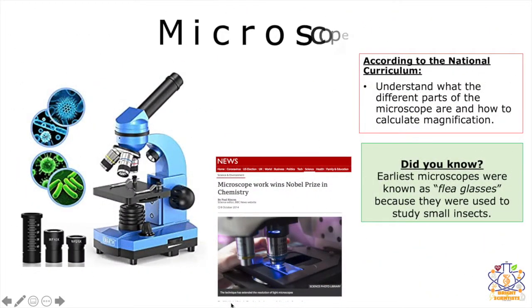Today's lesson we'll be looking at microscopes and how they are so useful to look at microorganisms. According to the national curriculum, you need to be able to understand what the different parts of the microscope are and how to calculate magnification.